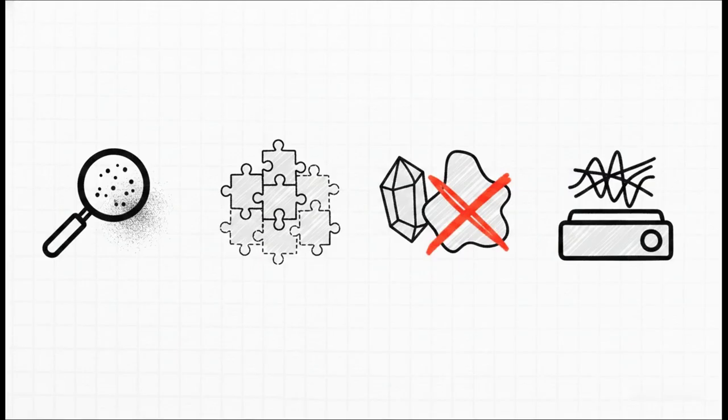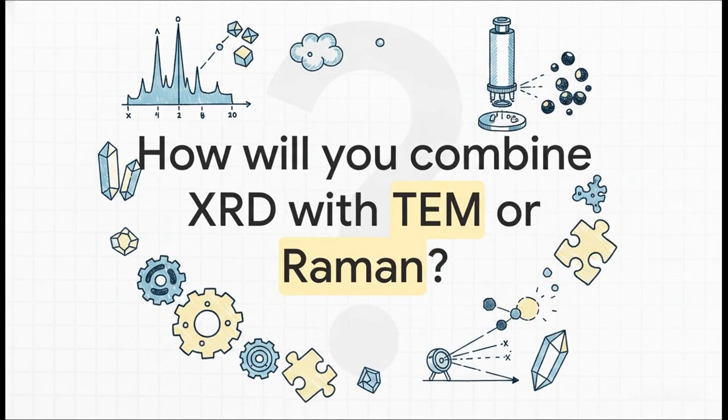Second, remember that it measures the coherent domain, meaning the continuous crystal lattice. So if several crystals clump together in an agglomerated particle, XRD only sees the individual crystalline puzzle pieces, not the whole clump. Furthermore, it can't accurately quantify amorphous or non-crystalline content all on its own. And finally, you always have to correct for instrumental broadening, simply because the machine itself inherently blurs the data a tiny bit.